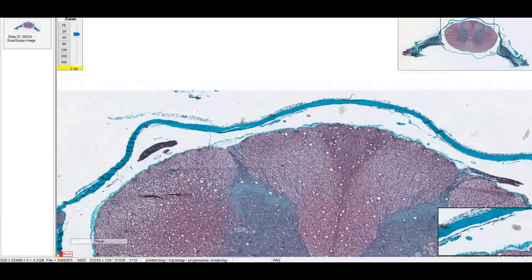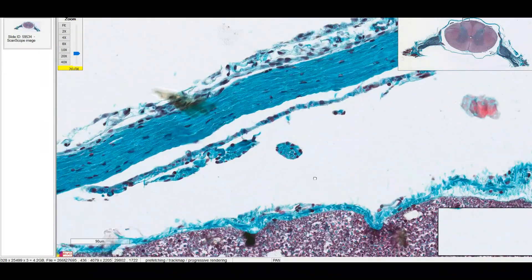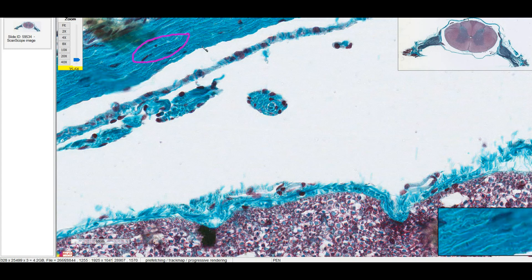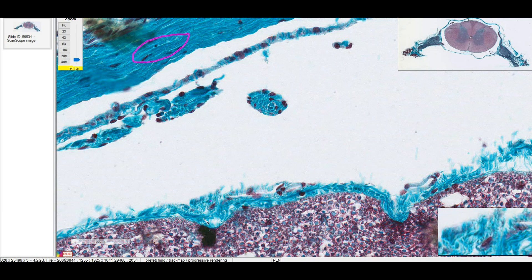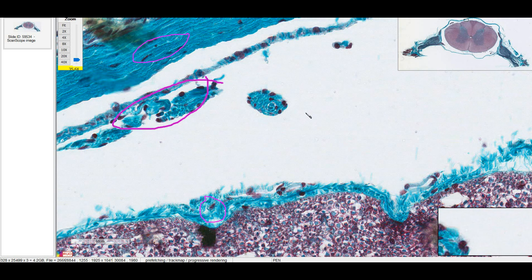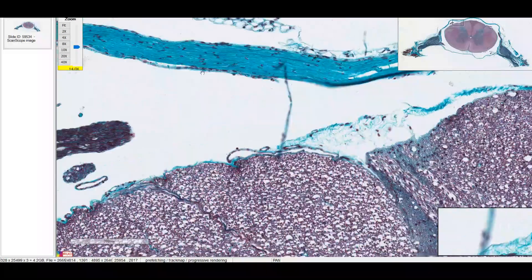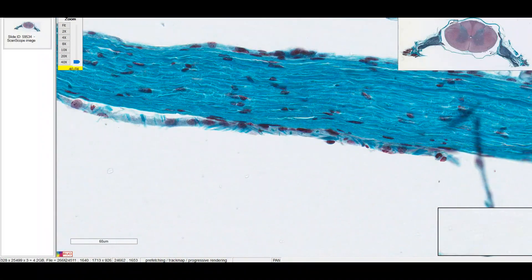Now let's zoom in and take a closer look at the meninges. On the outside, we have dura mater. It's this tightly packed material here. Immediately adhering to the spinal cord, we have pia mater. And this is the arachnoid mater in the arachnoid space. Sometimes there will be bits of arachnoid mater that are attached to the pia down here. It's a little hard to differentiate between pia and arachnoid down here.